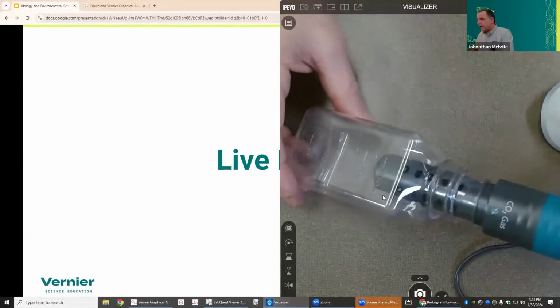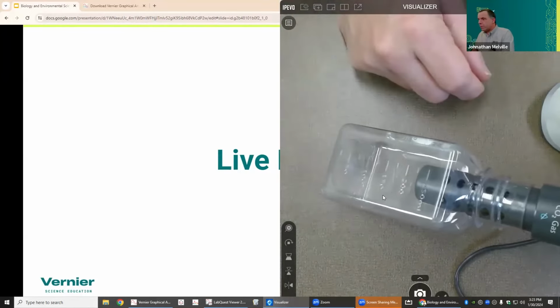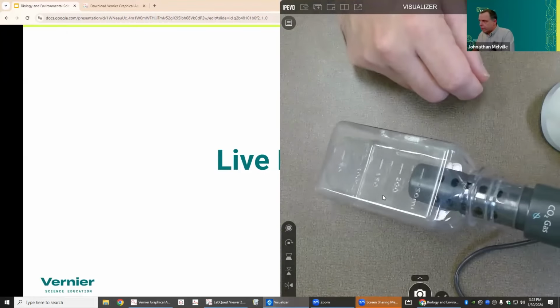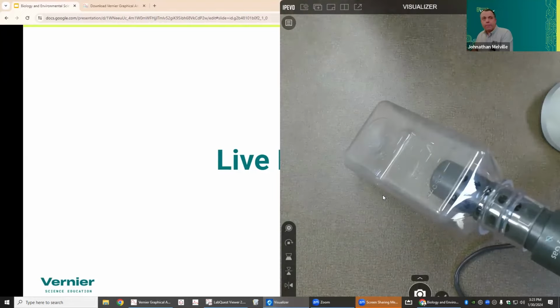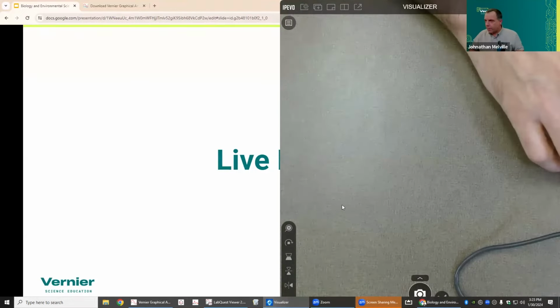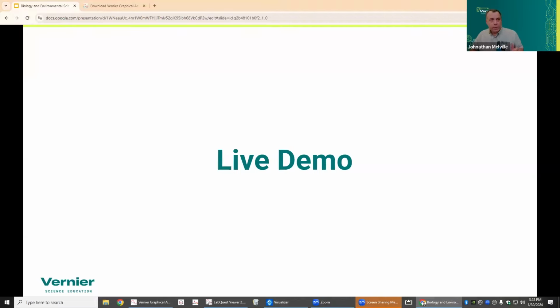For CO2, other organisms like crickets work really great. Caterpillars work really great. It just depends on what you have access to use. Let me just back up here a little bit. Humans produce really high amounts of CO2, so one thing you need to be aware of is that even breathing on the sensor is going to make the CO2 level go up really high. But that's why it's really great for being used with animals or other things like that. So yeast, crickets, caterpillars, etc.